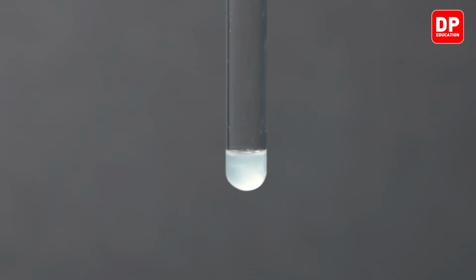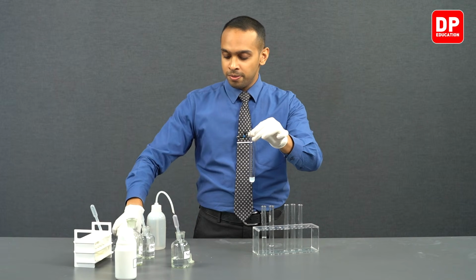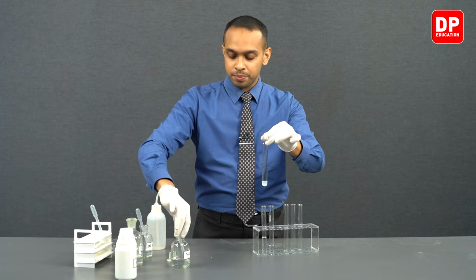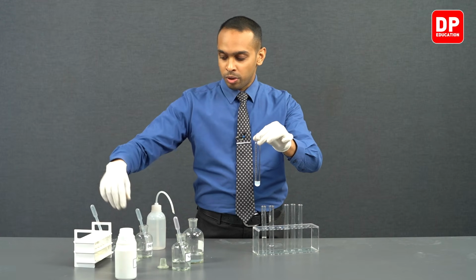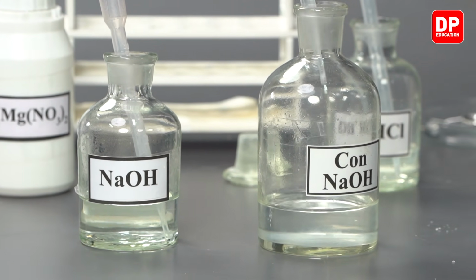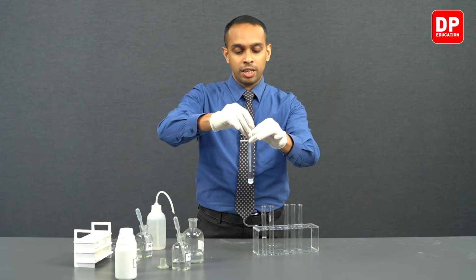To the second sample, we are going to add a small volume of concentrated sodium hydroxide. Let's take our concentrated sodium hydroxide reagent bottle here, and with a new dropper, we will add a few drops of concentrated sodium hydroxide to observe what takes place.